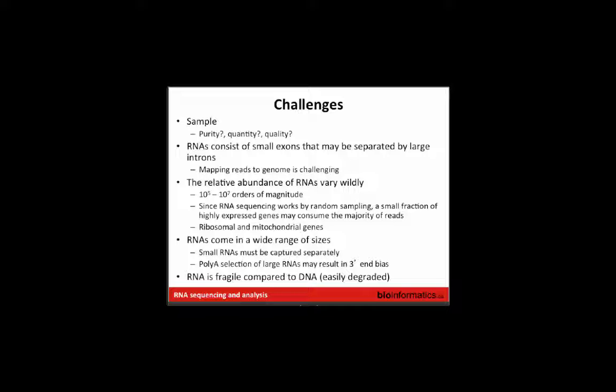I think probably even more of a concern is, or it's less of a concern because it's actually really, really hard to do a good job of normalizing the library. It's very difficult to actually get to a point where you have even representation of all your transcripts. Usually you've just pushed it a little bit in that direction, and you still have a quite wide range.